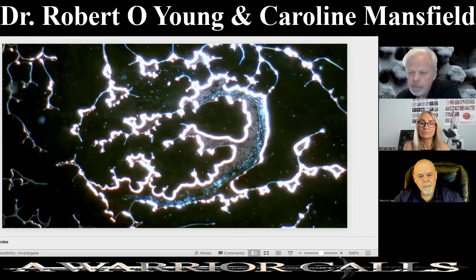But all this other stuff appears to be synthetic. So the proteins are combined with synthetic material while it's encased in this microfilariae parasite that we see here. As you were poking at it, I'm not sure that it was alive or not, but it's definitely a living organism that shouldn't be found in human blood. And I think you've got some other examples going down your slides. But that's what it appears.